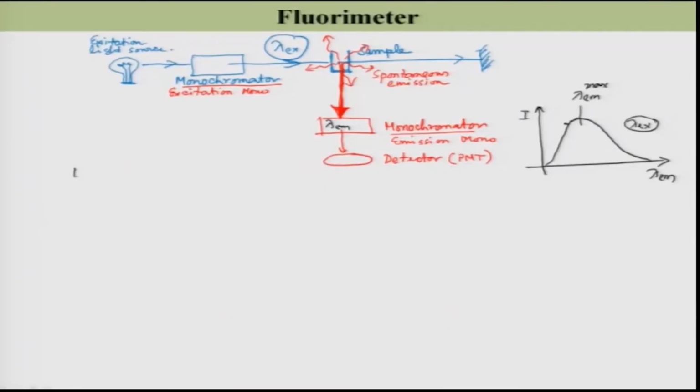What I wanted to say, let me say that clearly: the light source, monochromator, and detector are not ideal. Why do I want to discuss these things? Let us start with the detector part.